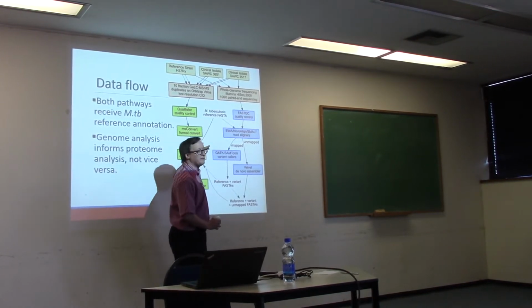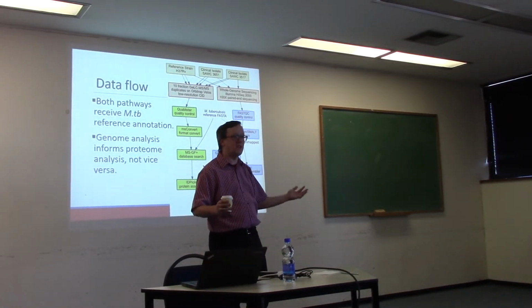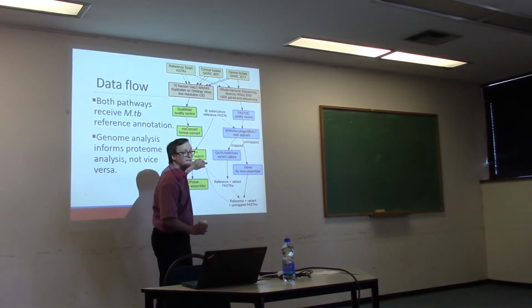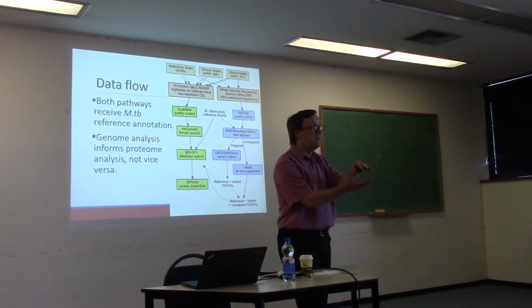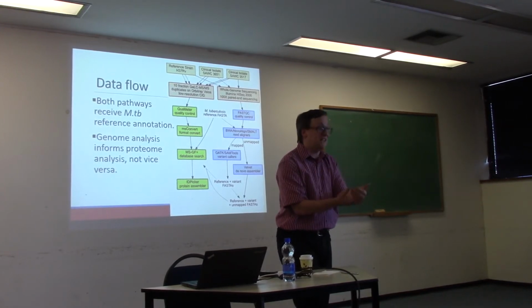But at the end of the day, we were able to flow 3 different kinds of sequence databases across. One would be the reference proteome. We already know all of the proteins that should be found in H37Rv. That's kind of our base for all additions later on. The next would be adding variant peptides. This is a case where we had sequencing reads that mapped to the genome of MTB, but they showed that there were some non-synonymous single nucleotide variations.